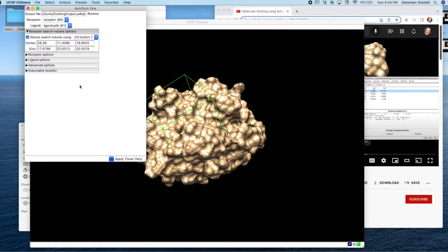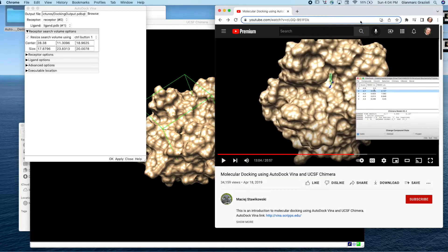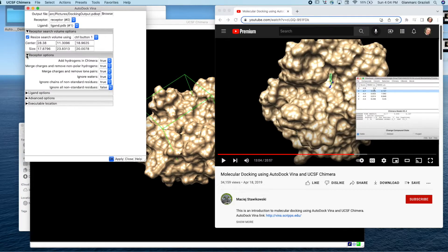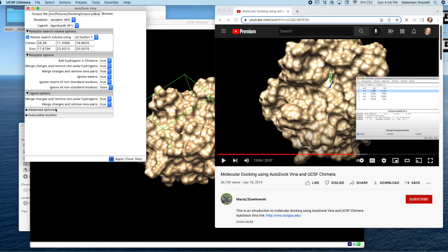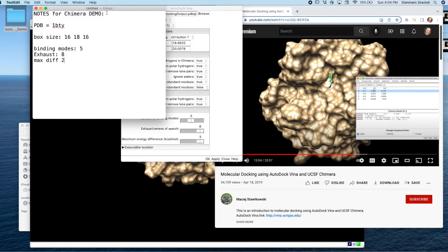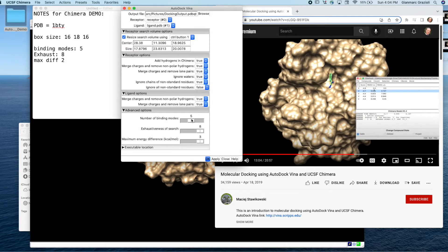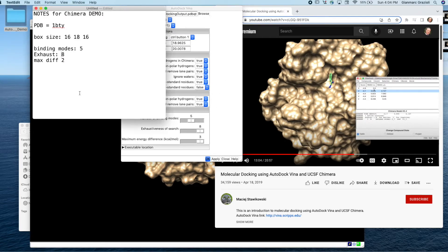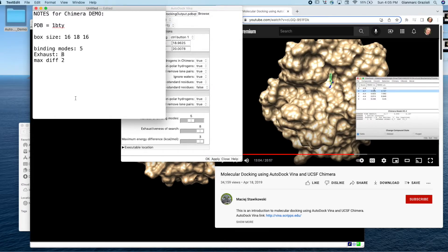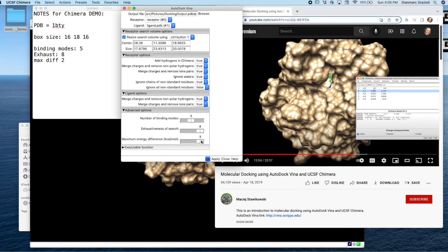I'm just going to run with the stuff that I selected with the mouse. But in the proper tutorial here by Maciej, he adjusted the size by typing some numbers in here. You can do that if you want. I think I'm just going to try and run with this. So now receptor options, these were all left default in that video. So I'm going to do the same, same thing for ligand options. We ran with all defaults. Advanced, let's see. I wrote some notes on this one binding modes. The tutorial went with five. So we're going to do five exhaustiveness. We're going to max it out at eight and then maximum energy difference, the tutorial did it to. Let's do it too.